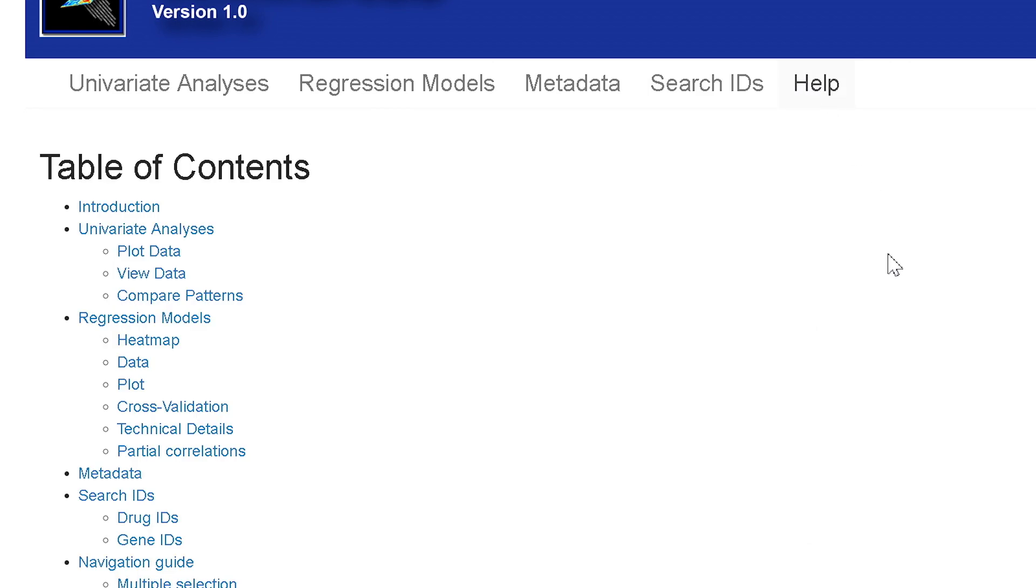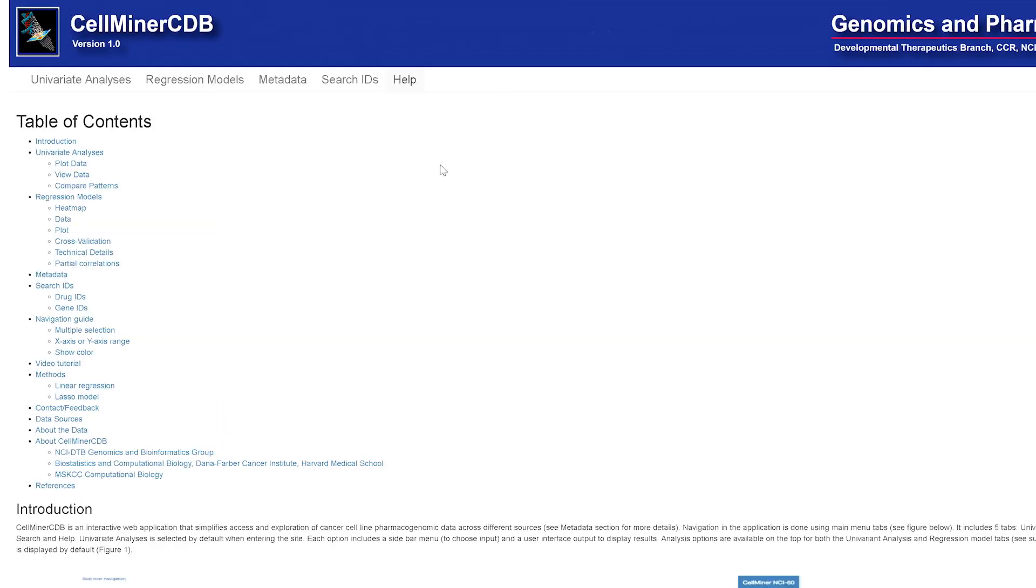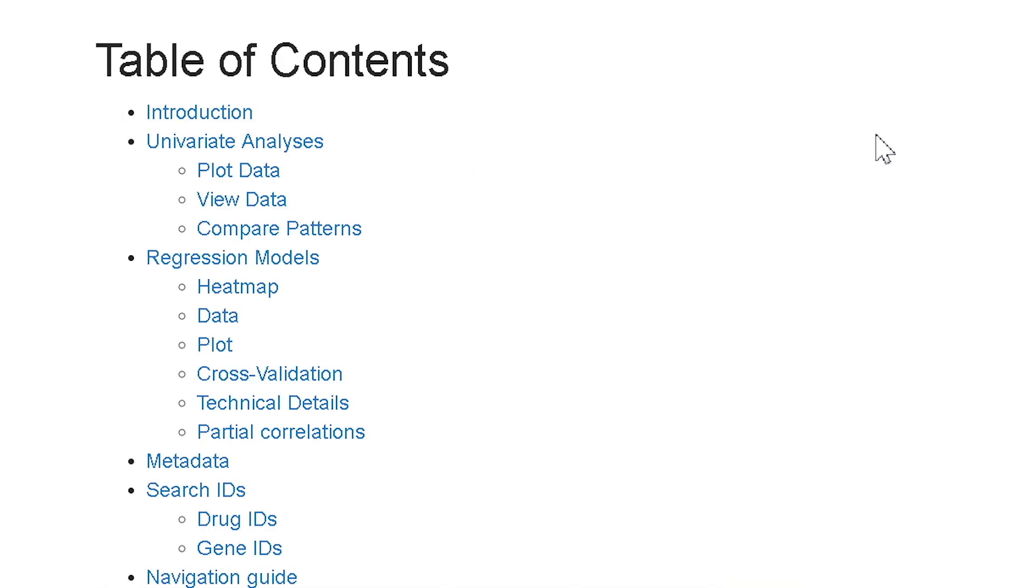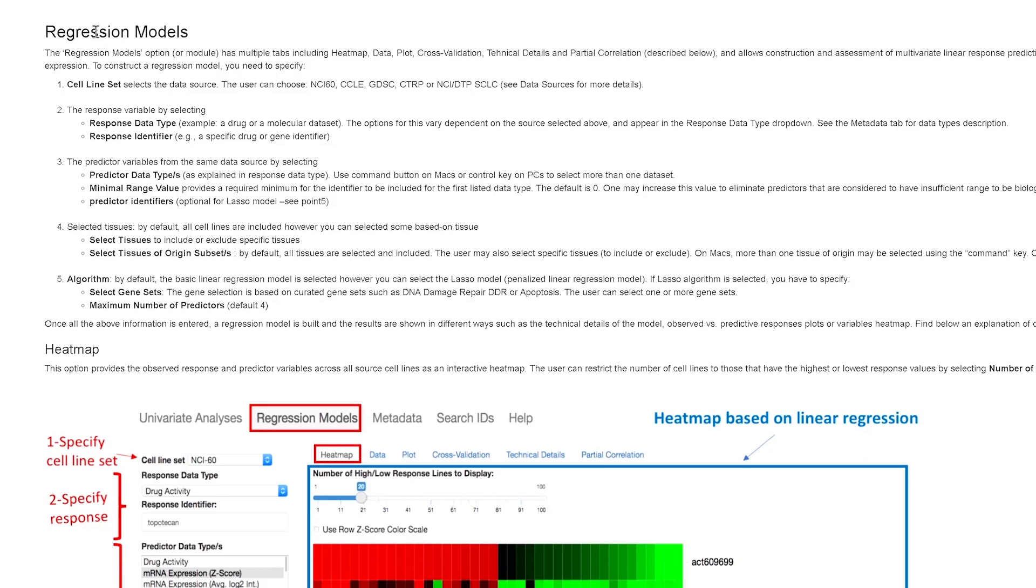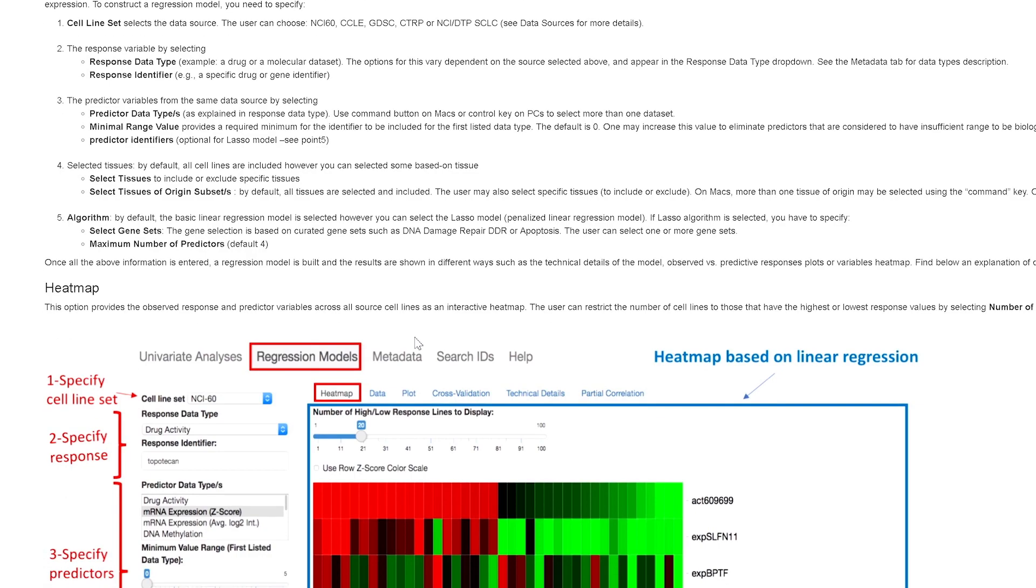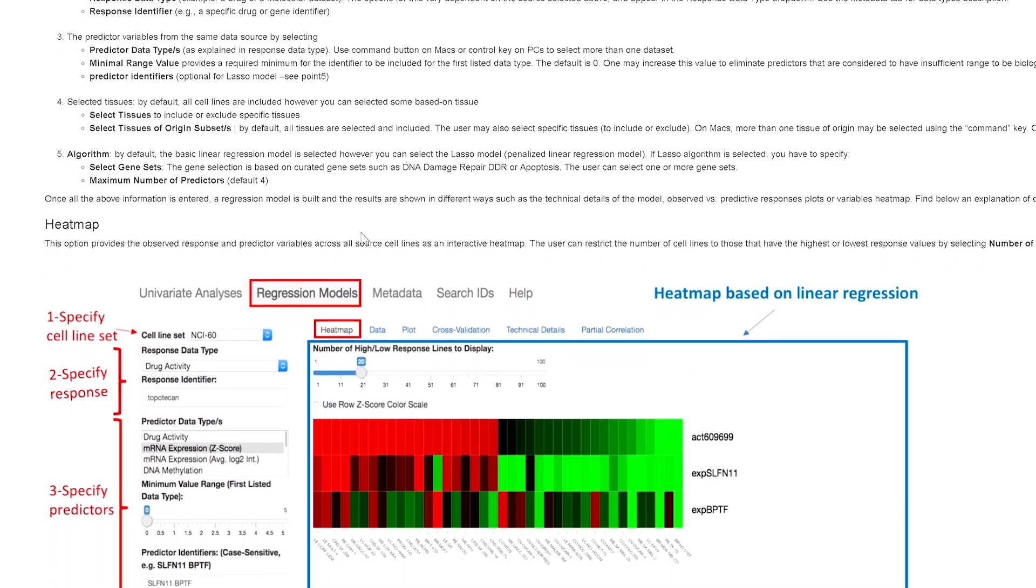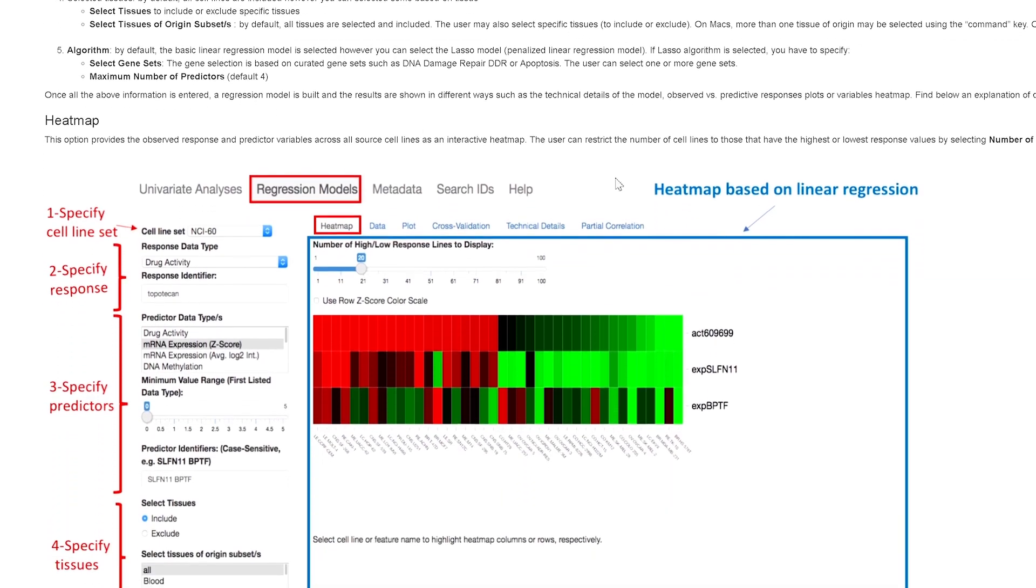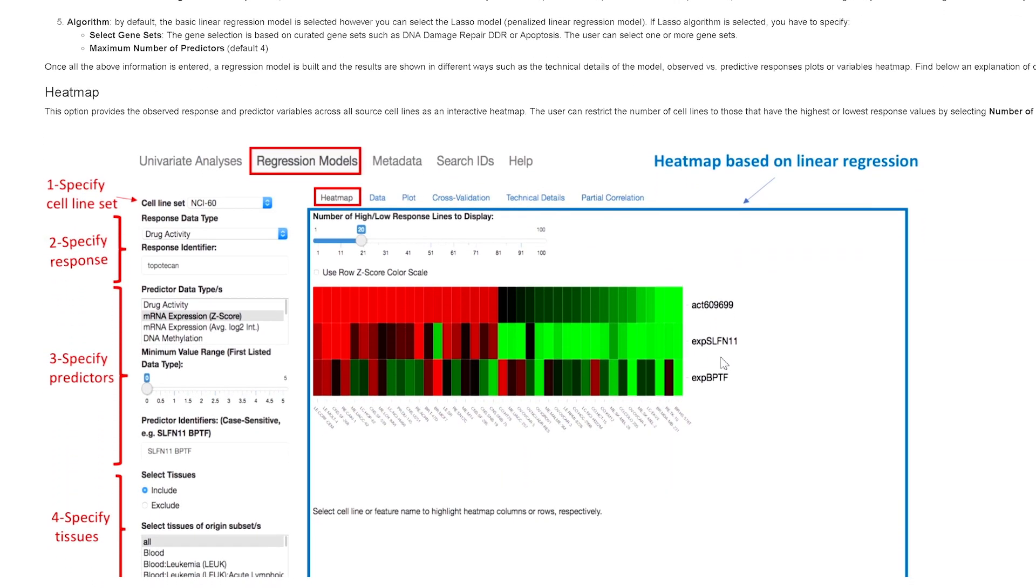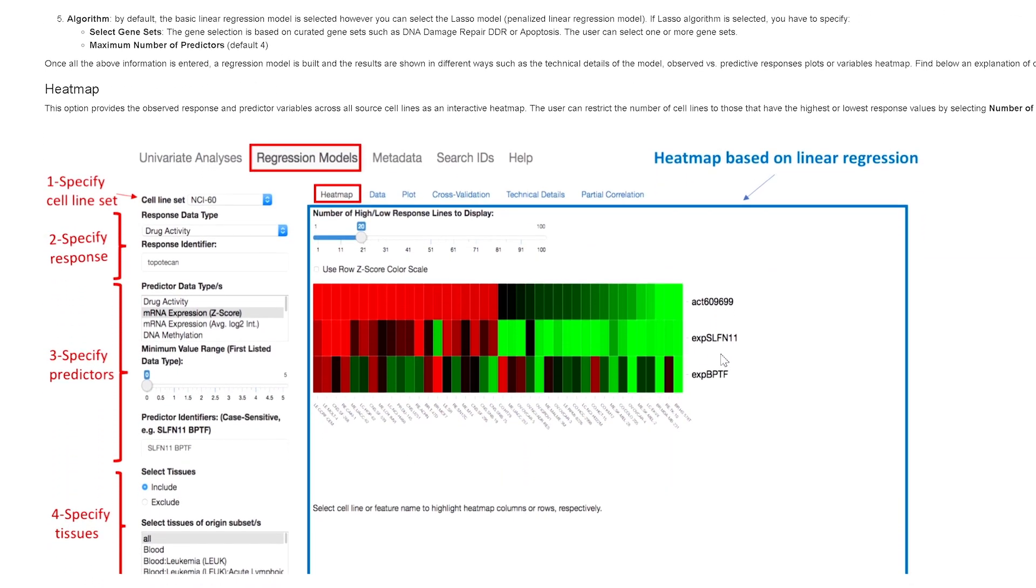In the Help section, we provide the motivation, background information, descriptions, and illustrations for how to use CellMiner CDB. So for instance, if you wanted more information on how to do regression models, you would click there, and there's a bunch of text here describing what you do, as well as illustrations of how to do it.